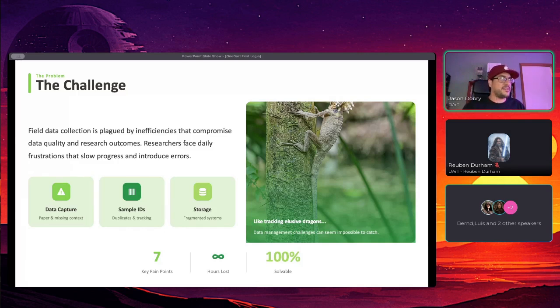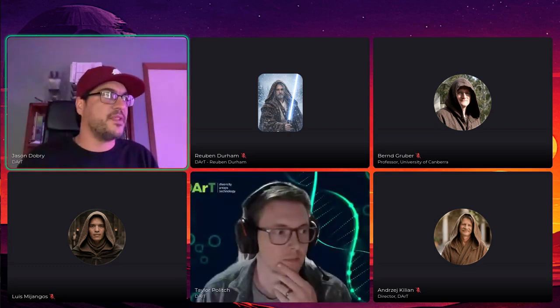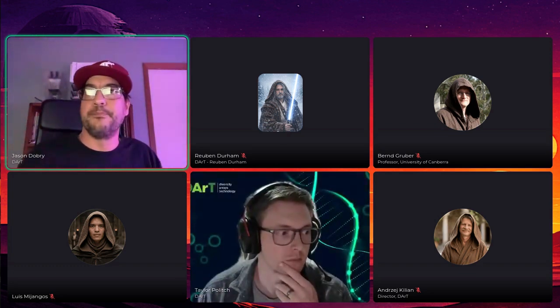And so Taylor will be able to take you on a journey through the web application, and then I'll walk you through an example with the mobile app.